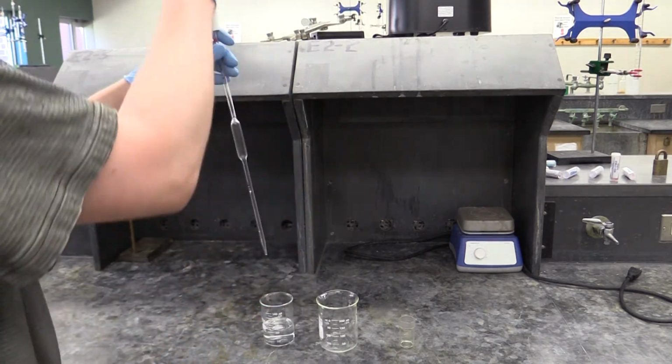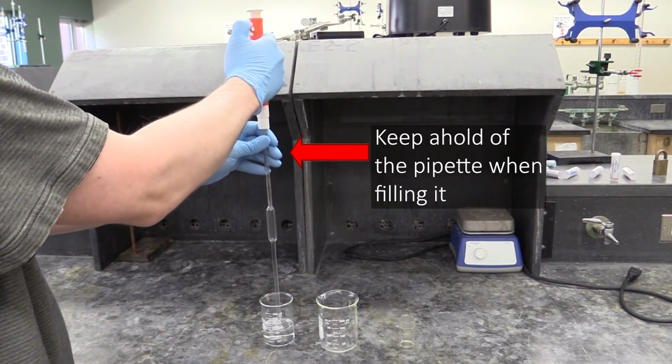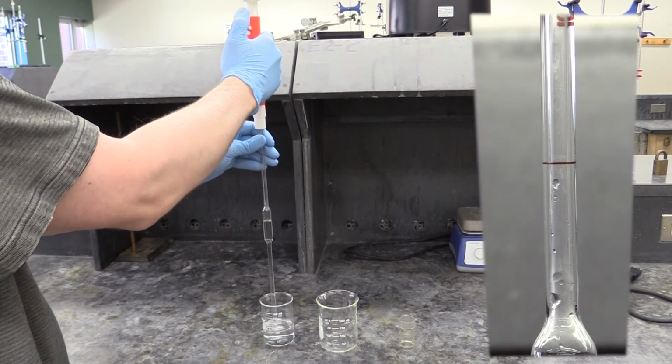Now let's talk about the pipette. To use your pipette, you first use a pump to draw solution up to just past the pipette's index line.